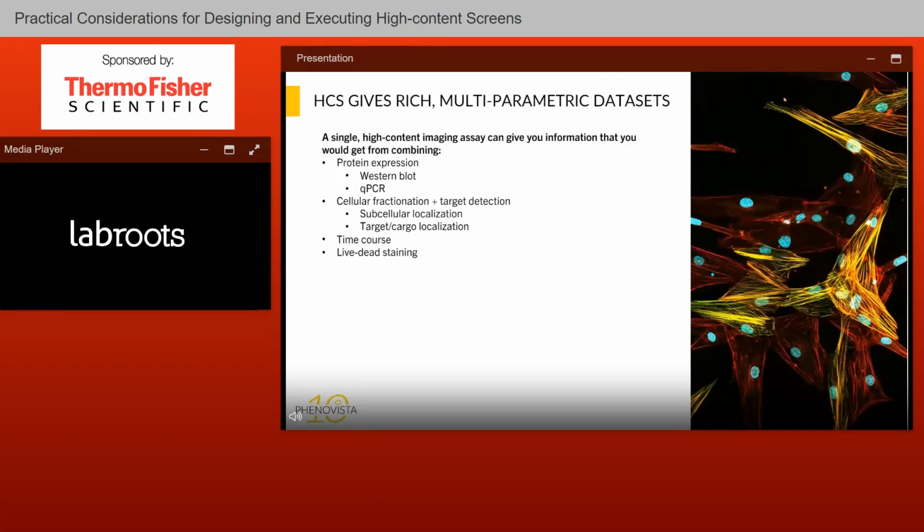What is often a surprise for people who are not familiar with this type of approach is that all cells are not the same. You can see just on this example on the right here that the cells have a distribution or a variety of different shapes, different staining intensities, even their nuclei vary slightly. And this is all part of the natural amount of variation that you get in biological models. So being able to quantify that is really important.